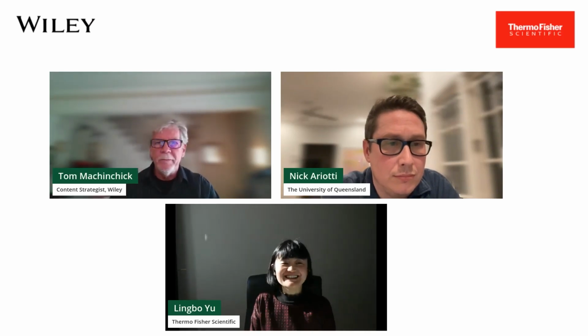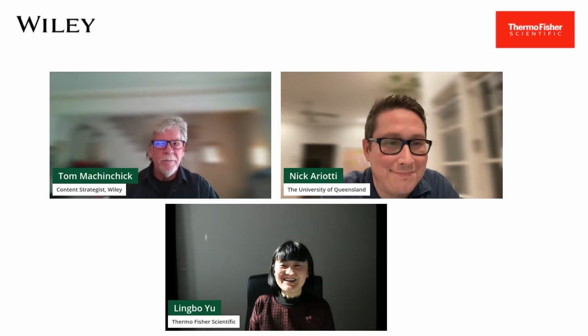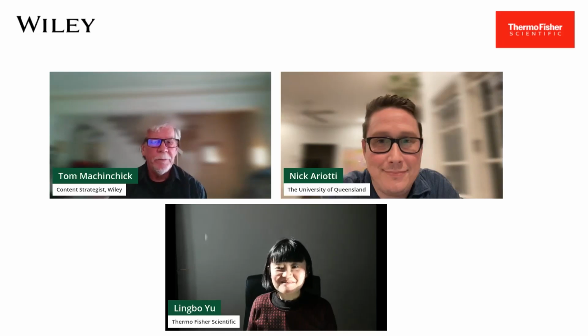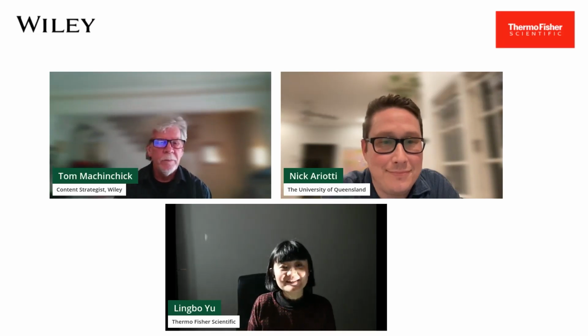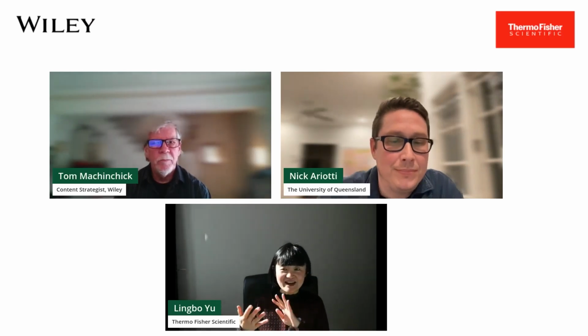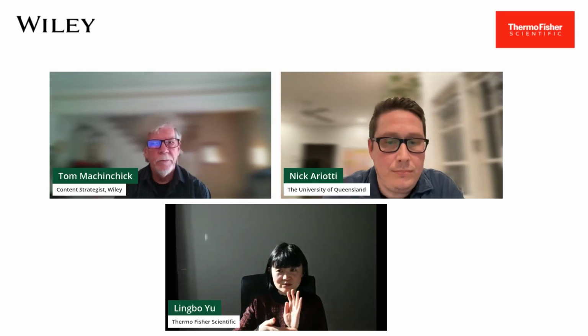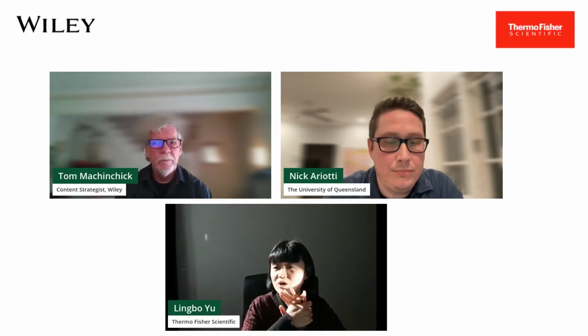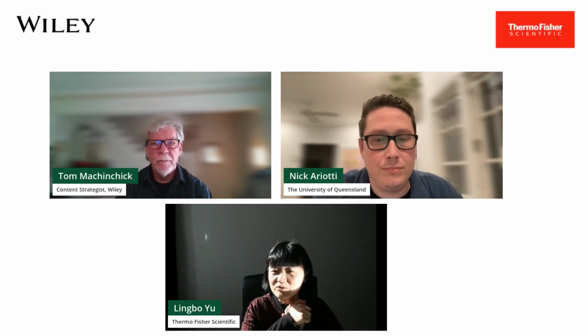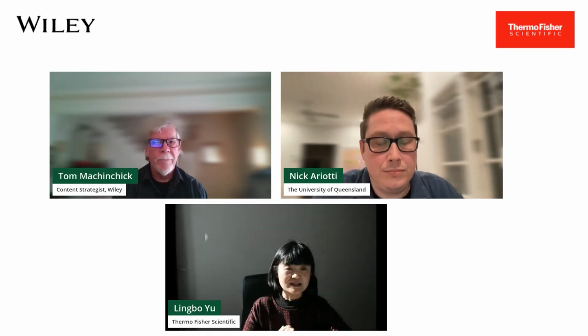First, I'm glad that you find MAPS fantastic. Of course, MAPS and tomography software are connected. MAPS sessions can be imported into tomography sessions. So I showed in one of the tiny images where you can have the fluorescence overlaid on top of the search map, which allows you to target your region of interest more accurately.